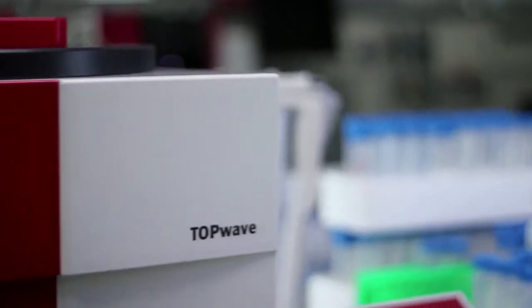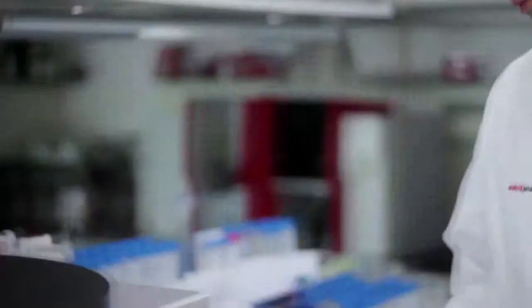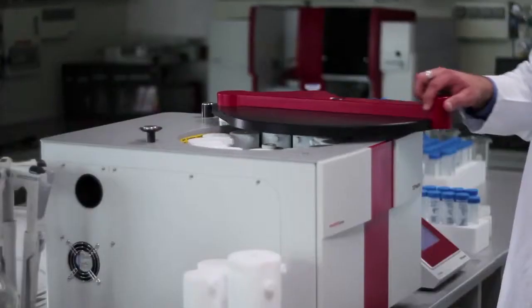Our range of atomic absorption spectrometers is further complemented by TopWave, a flexible microwave digestion system, and the unique mercury analyzer Mercur.